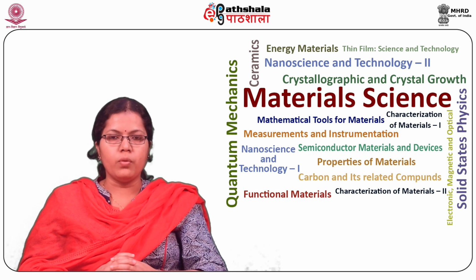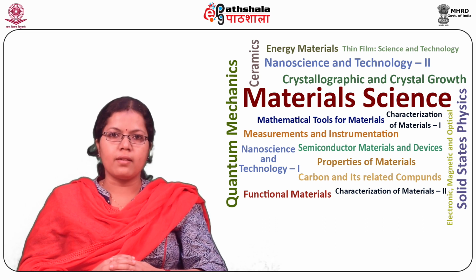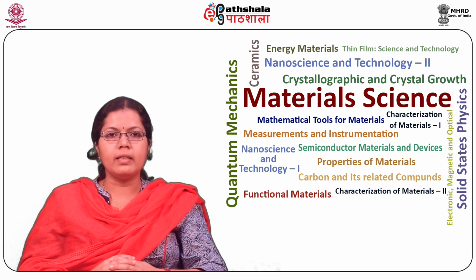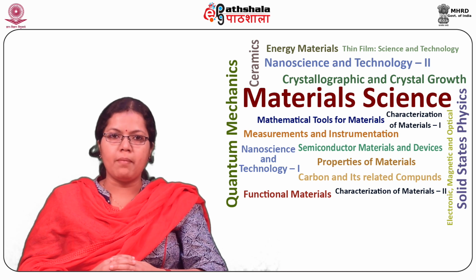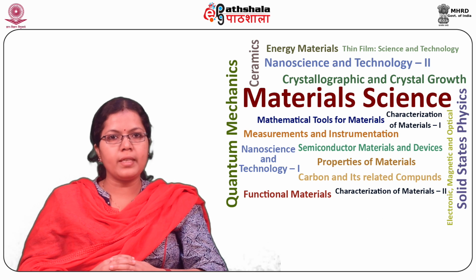A scanning electron microscope or SEM is a type of electron microscope that produces images of a sample by scanning the surface with a focused beam of electrons. The electrons interact with atoms in the sample, producing various signals that contain information about the sample's surface topography and composition. The electron beam is scanned in a raster scan pattern, and the beam's position is combined with the detected signal to produce an image. SEM can achieve resolution better than 1 nanometer.